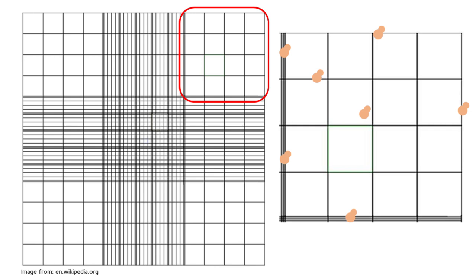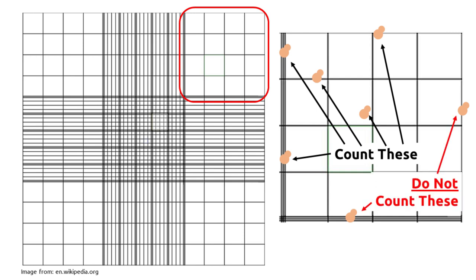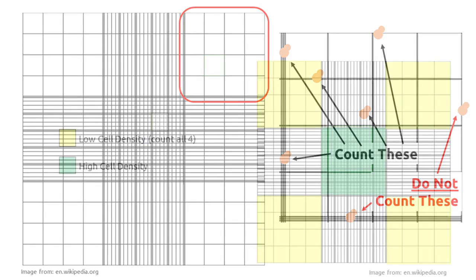You need to be extra careful when counting on the edges, especially if you're worried about precision. The edges typically will have a double or triple line, so what you want to do is on the left or top sides of that major grid area count any cells touching any of the lines that demarcate the edge of the grid. However on the right side and the bottom of the side don't count any cell that touches any of the lines on the grid. This ensures you're always counting the exact same region and that the region you're counting is exactly one millimeter by one millimeter in dimension.